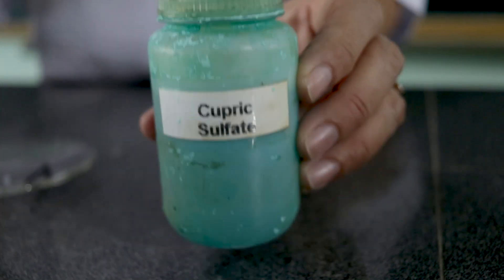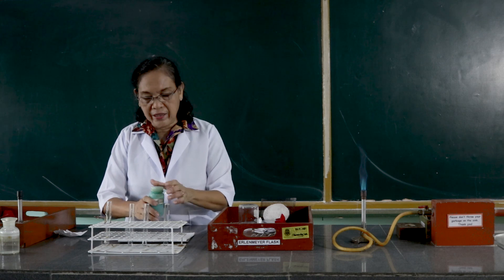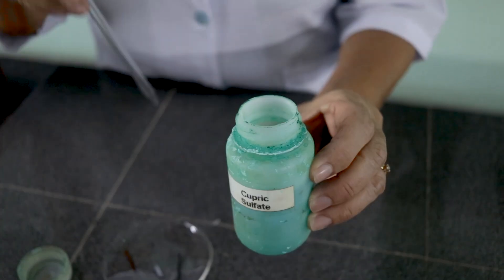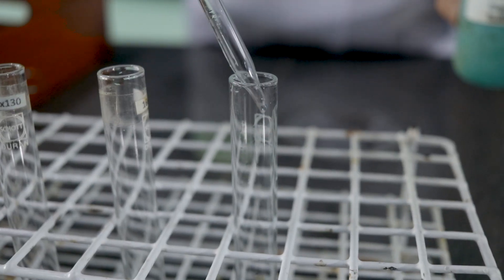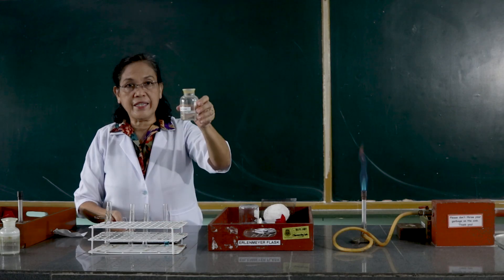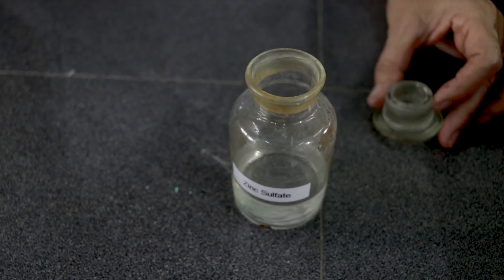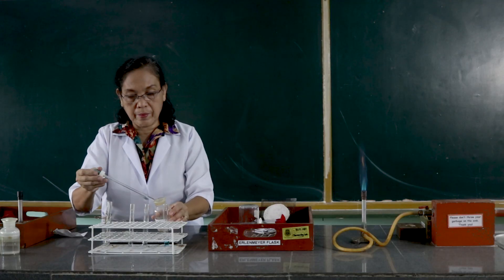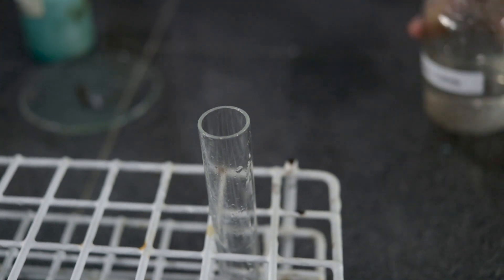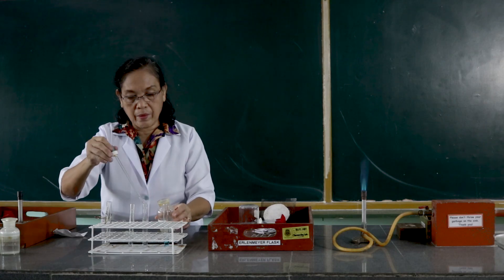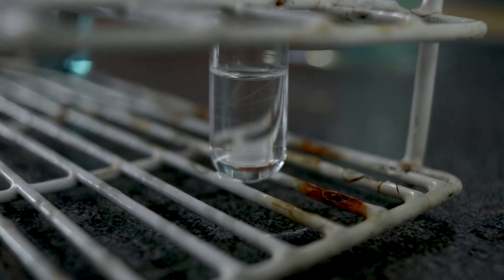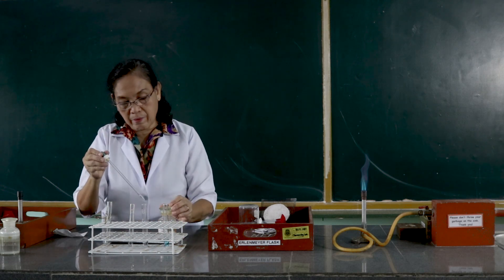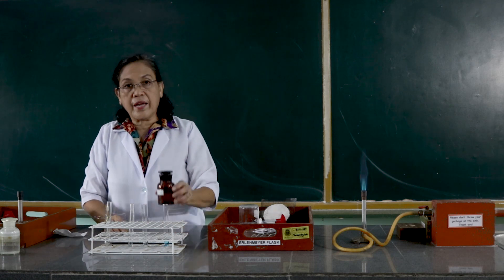This is the copper sulfate — let us get 5 ml of this. This is the zinc sulfate. And this is the silver nitrate.